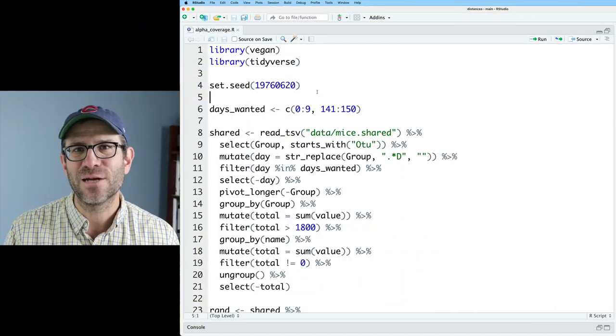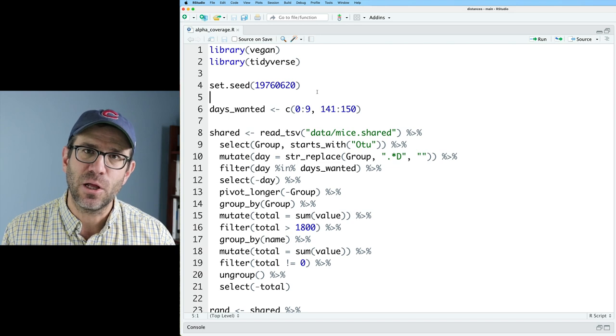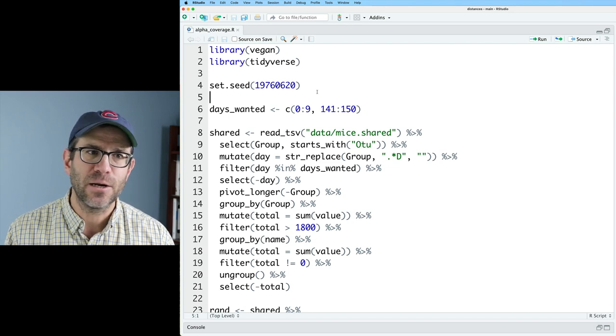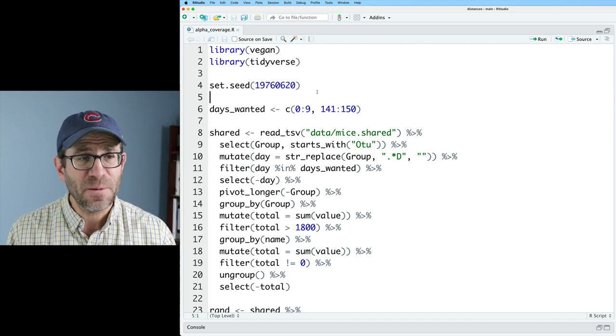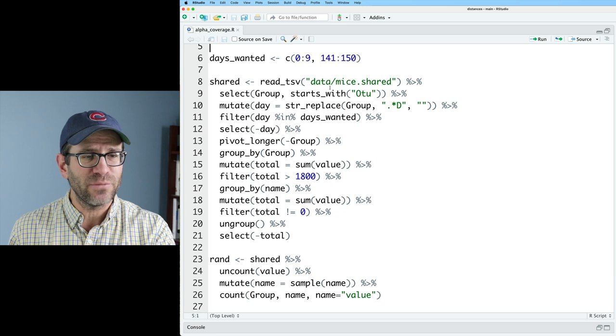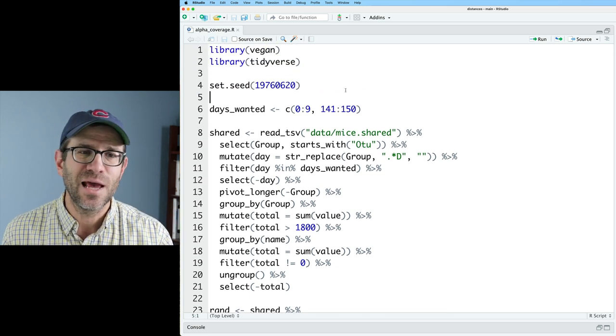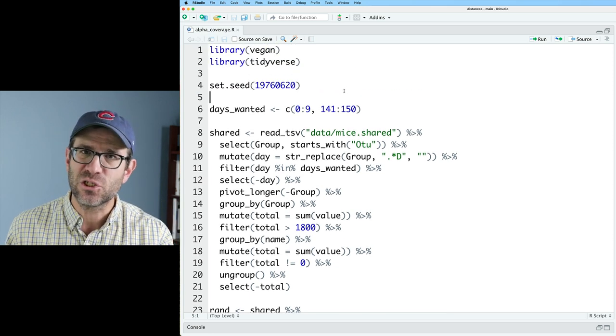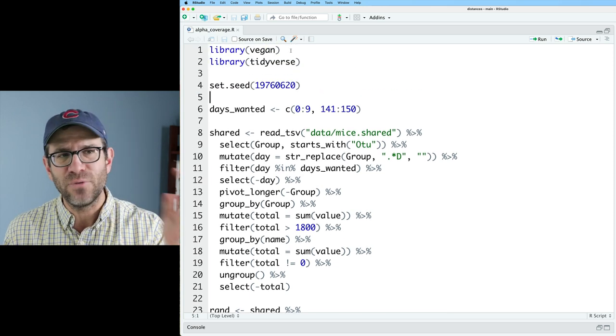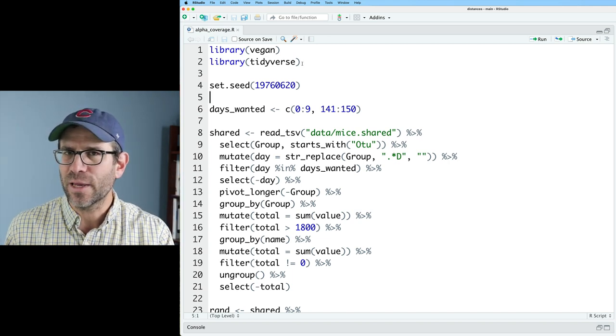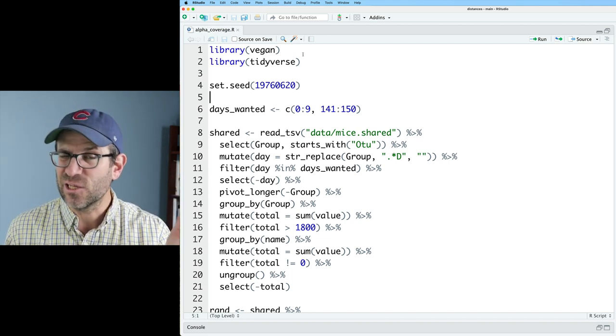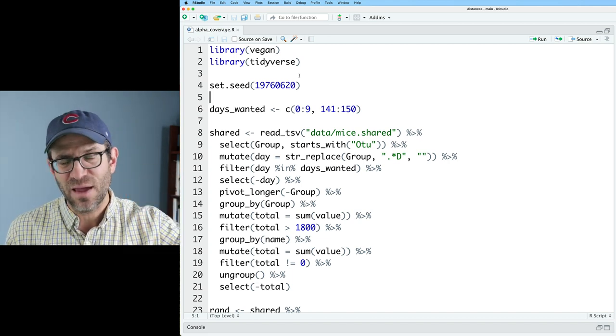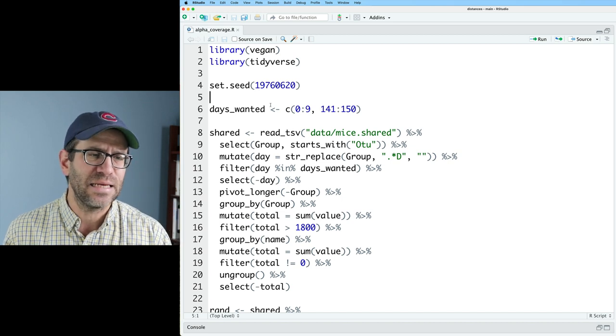As always, I'm working out of RStudio. I've got a script already set up here called alpha coverage dot R. This is basically what we've seen over the past several episodes as a starting point. We've got vegan, tidyverse that we're loading in as libraries. I don't think I'm going to actually use vegan, but we'll leave it in there as well as the set seed.